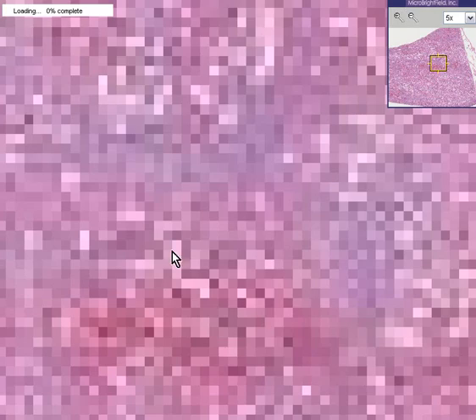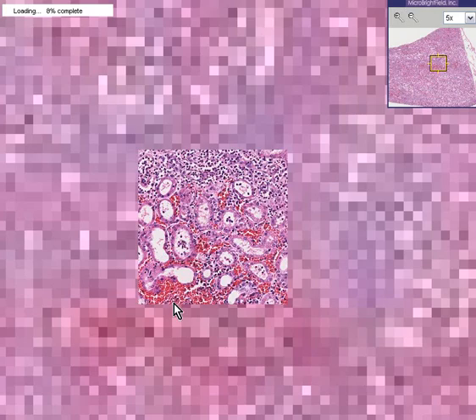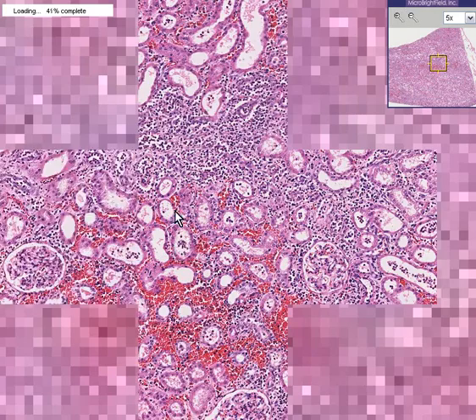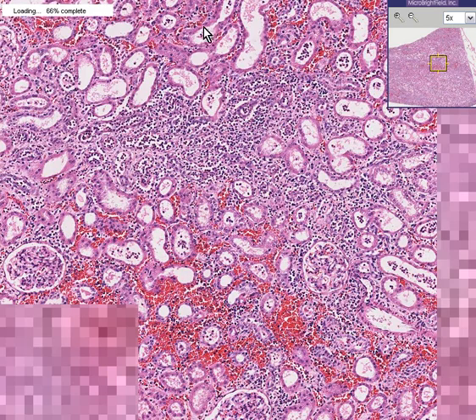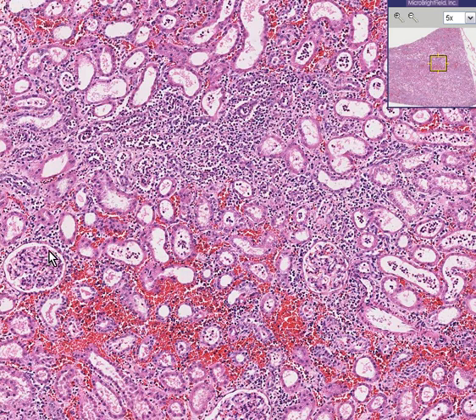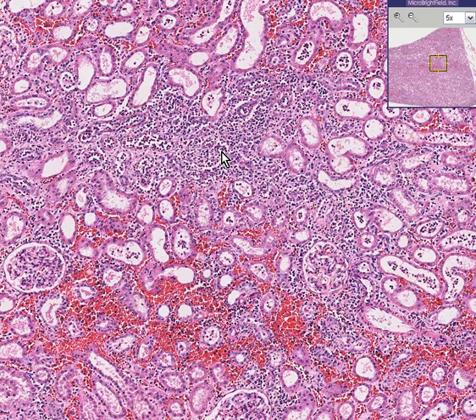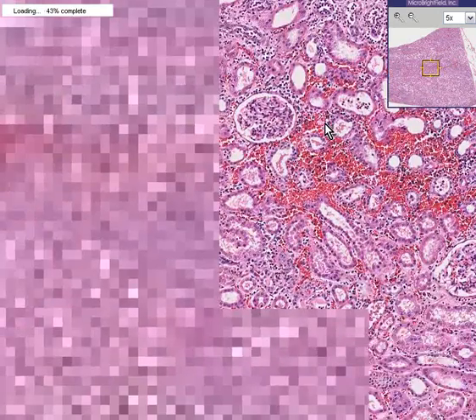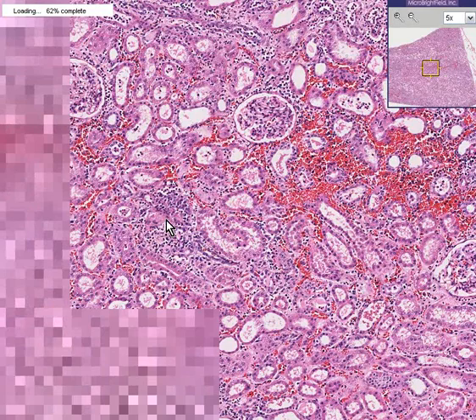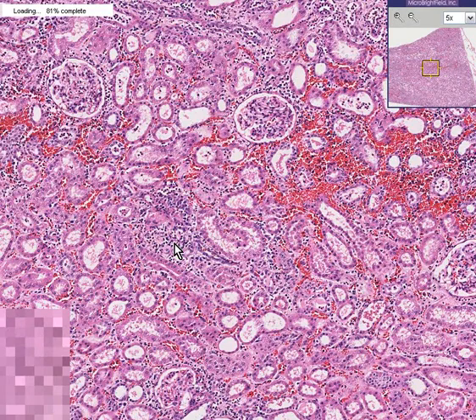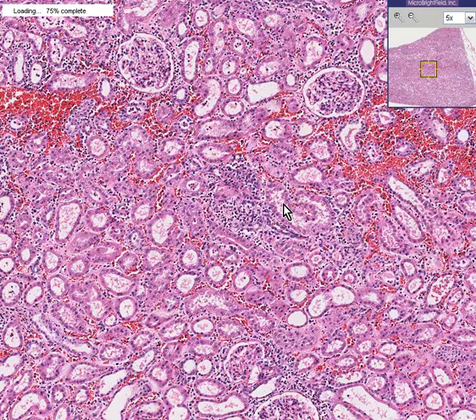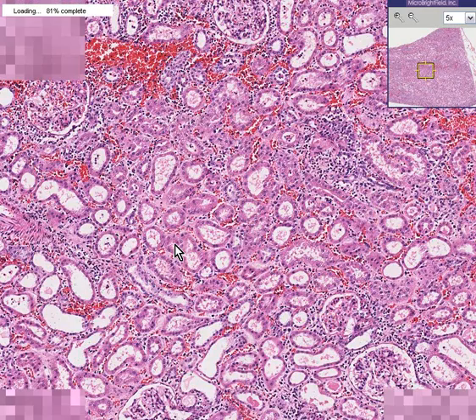The interstitium is the area between the tubules. You can see tubules here and here, and a glomerulus here, but the focus of inflammation is chiefly in the interstitium — the space between the tubules. Here's another significant focus of inflammation.